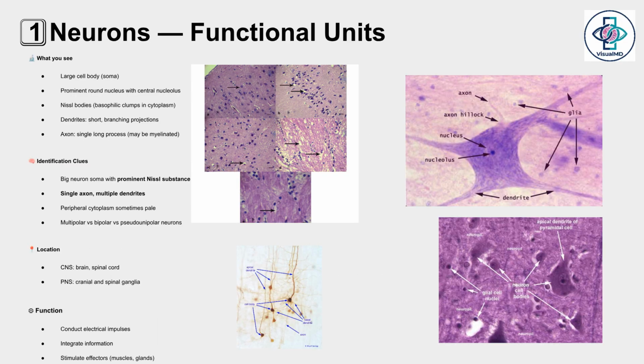Neurons are the functional units, recognized by a large cell body, prominent nucleus, and basophilic Nissl bodies. They conduct electrical impulses and integrate information.